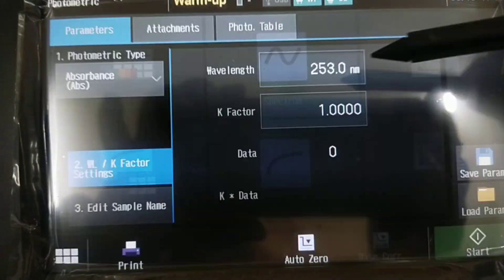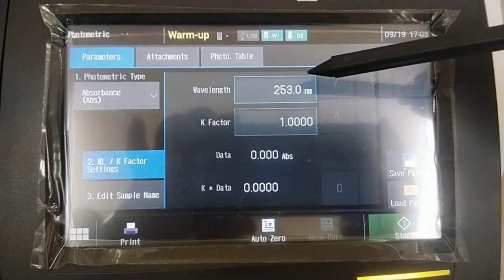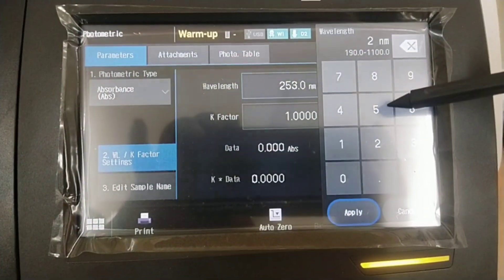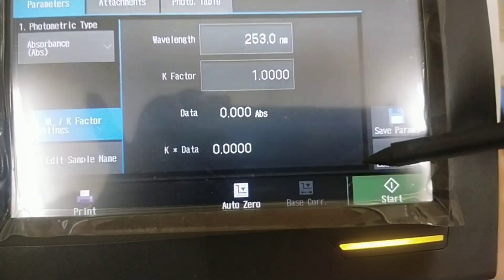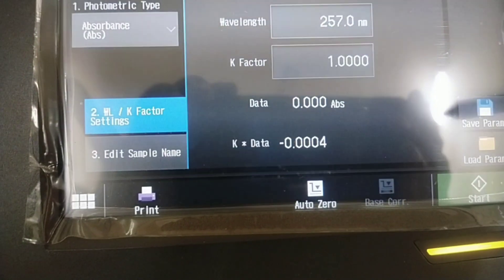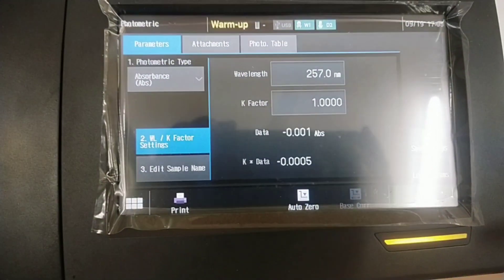Photometric mode measures the photometric value at a single wavelength or multiple wavelengths. In single wavelength mode, you measure the sample at a particular wavelength. Here you can select the specific wavelength. After selecting the specific wavelength, perform auto zero for blank and start measuring the sample.